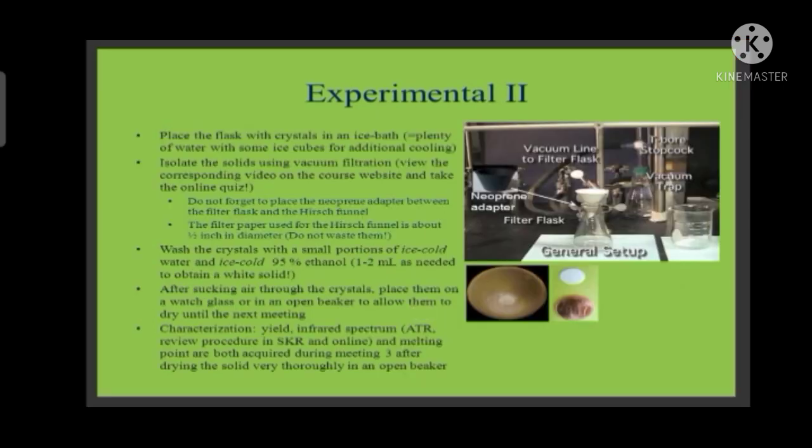After that we will place the flask with crystal in an ice bath. The ice bath should contain plenty of water with some ice cubes for additional cooling. Then isolate the solids using vacuum filtration. After that, wash the crystals with a small portion of ice cold water and ice cold 95% ethanol. Then after sucking air through the crystals, place them on a watch glass or in an open beaker to allow them to dry until the next meeting. After drying you will get your crystal, that is the benzoin crystal. After that you can calculate the yield or you can calculate the melting point or whatever you want.